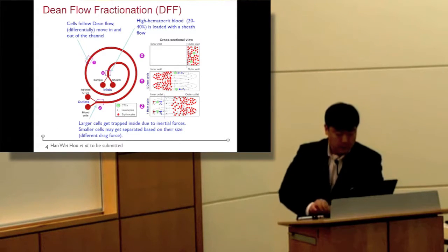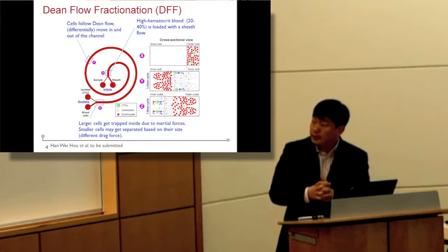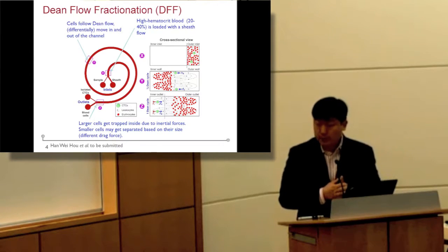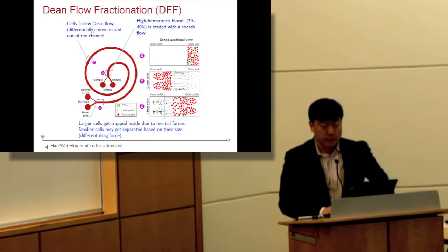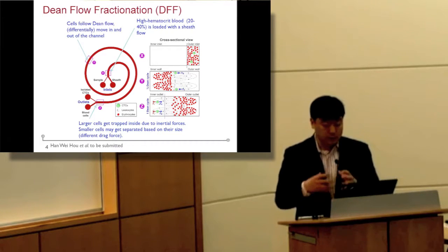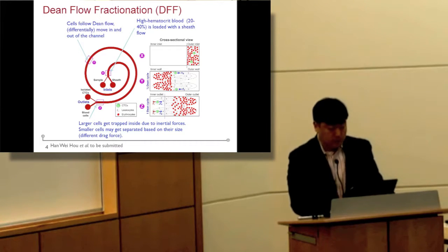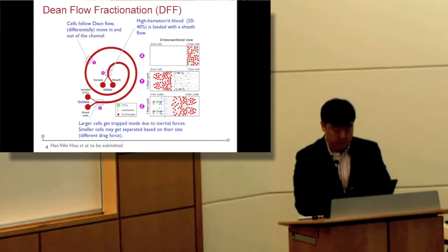So, in order to address some of these challenges, we have been working on a new way of separating cells from the blood, but still allowing high hematocrit samples. By that, I mean 20 to 40% hematocrit samples. So it wouldn't require you to dilute the blood sample that much, so that you can actually increase the throughput.